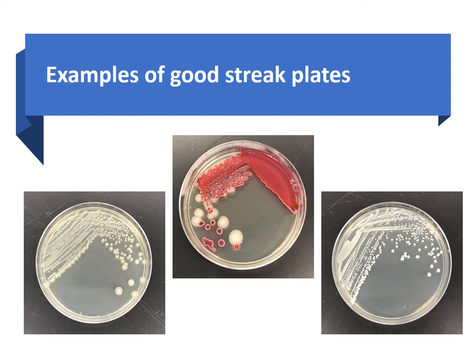And by looking at these single colonies, can you tell whether this plate is a mixed culture or a pure culture? I mean, how can you tell? Look at the colonies. Do they look the same? Meaning, do they have the same color? Are they the same size? Do they have the same texture, right? If you've answered no to all of these questions, then what does that tell us? It tells us that this plate is not a pure culture plate, it's a mixed culture plate.